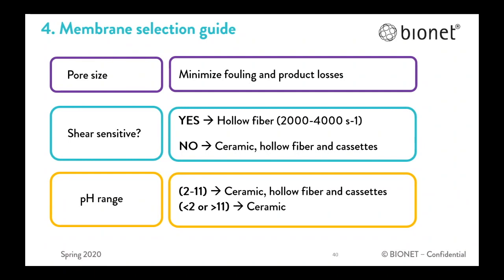Then we have to ask ourselves three main questions. Is our product shear sensitive? What is the working pH of my solution? What is the viscosity of our solution? The correct answer to these questions will give us the recommendation about the best membrane module to use.